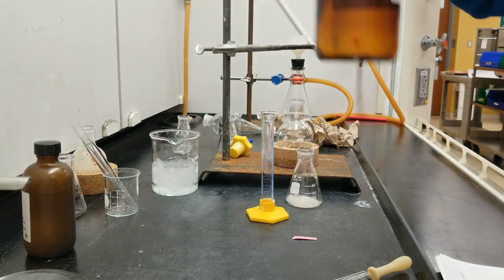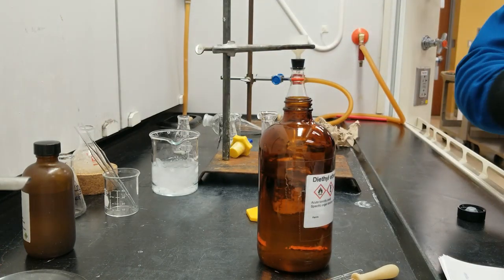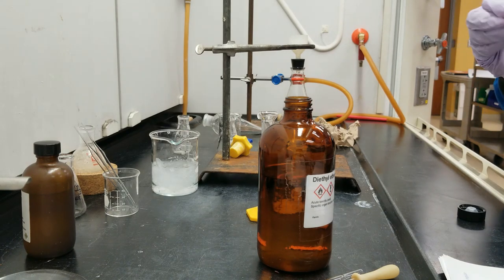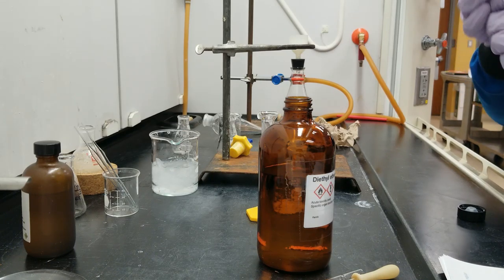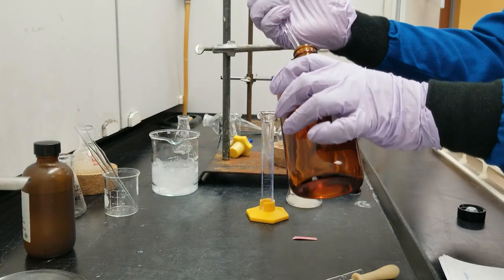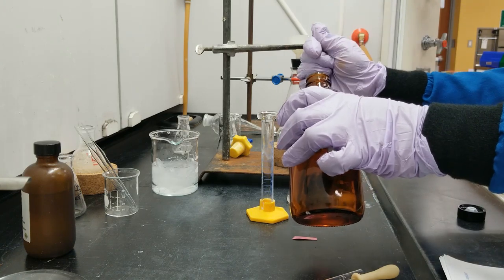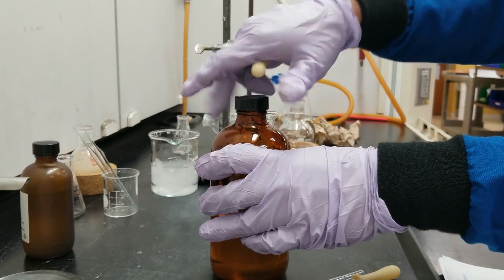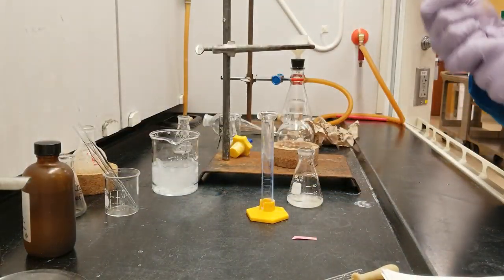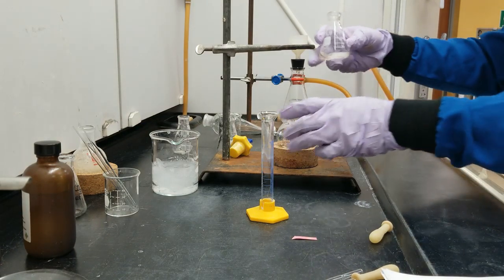I will give the sodium sulfate a wash with diethyl ether, about 5 mL of diethyl ether. You can do it in portions or you can do it at once. I'm doing it at once. Swirl, and then decant.